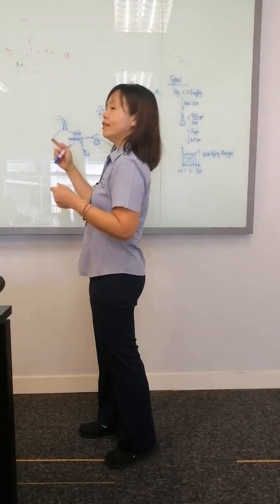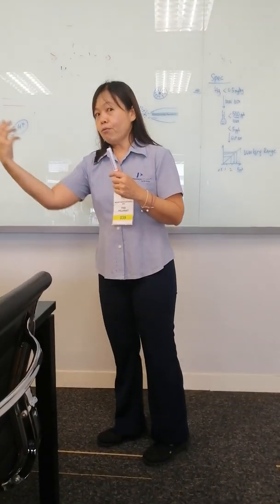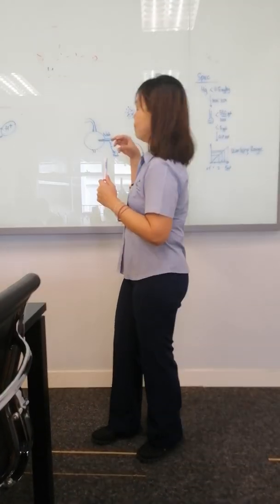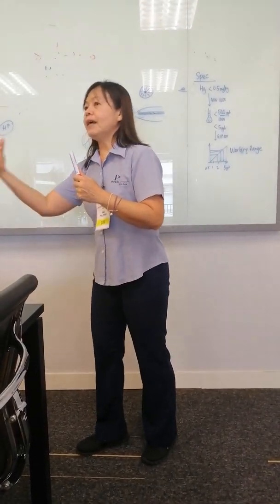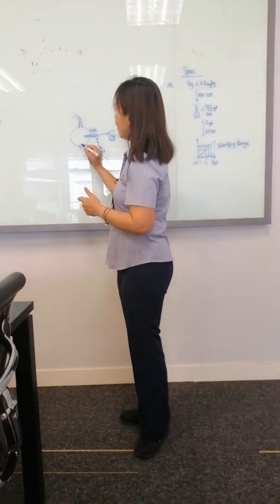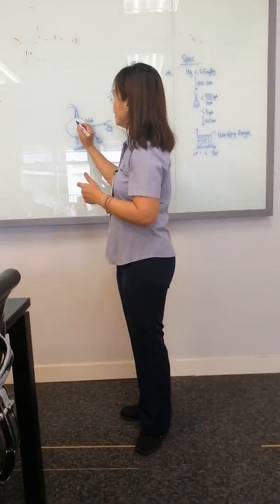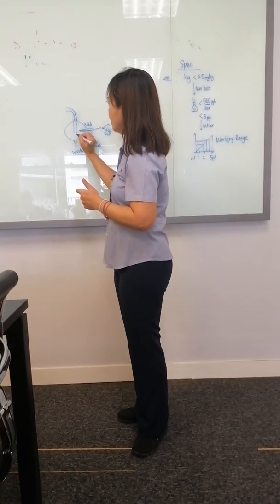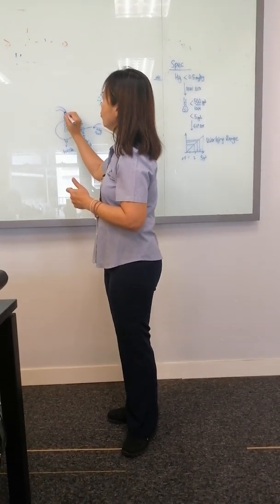So what we do is we use cyclonic. Cyclonic uses a centrifuge way. The sample will be pushed by the nebulizer gas and become aerosol, but some are big, some are small. So now you want to separate. The big droplets go to the waste. Then only the small ones, we want them to go into your injector.